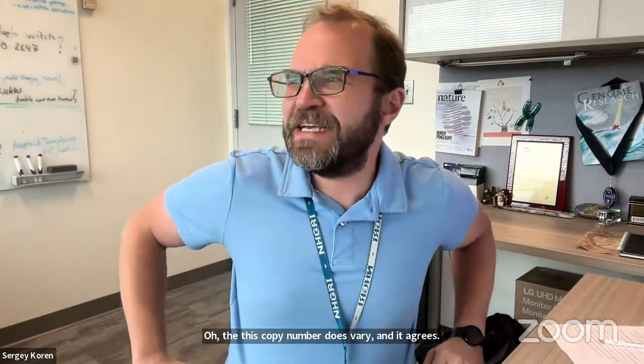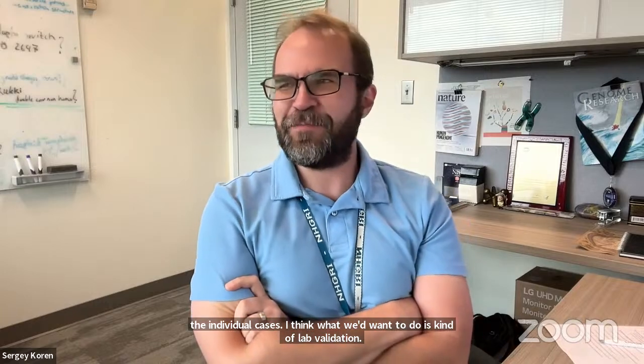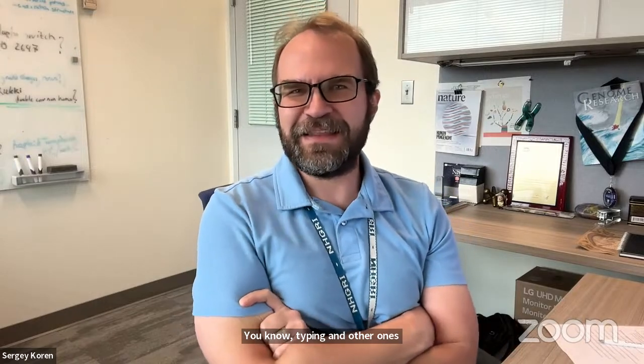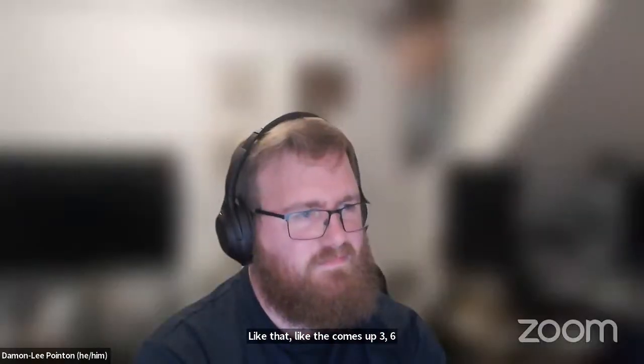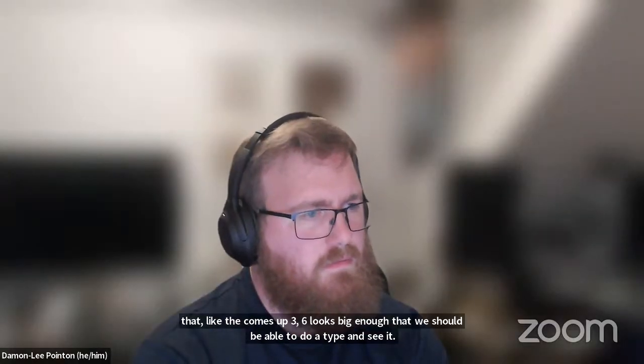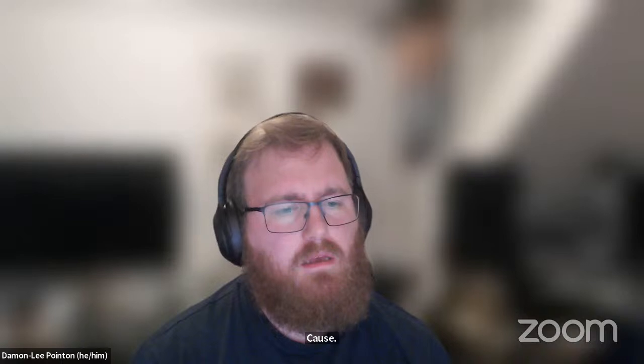In the individual cases, I think what we want to do is lab validation, karyotyping and other methods like that. Like the chromosome 3, 6 looks big enough that we should be able to do a karyotype and see it. But I think it'll be interesting to track these down and find some of these.